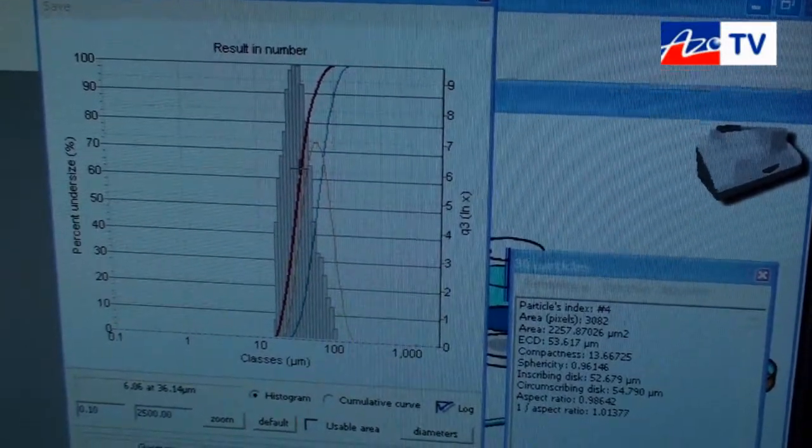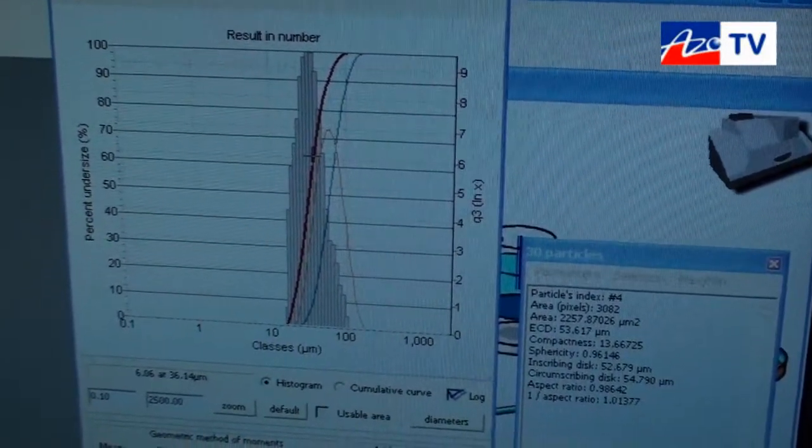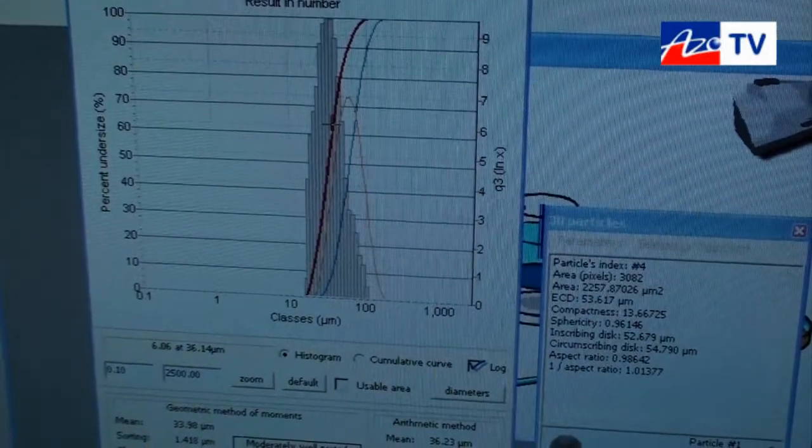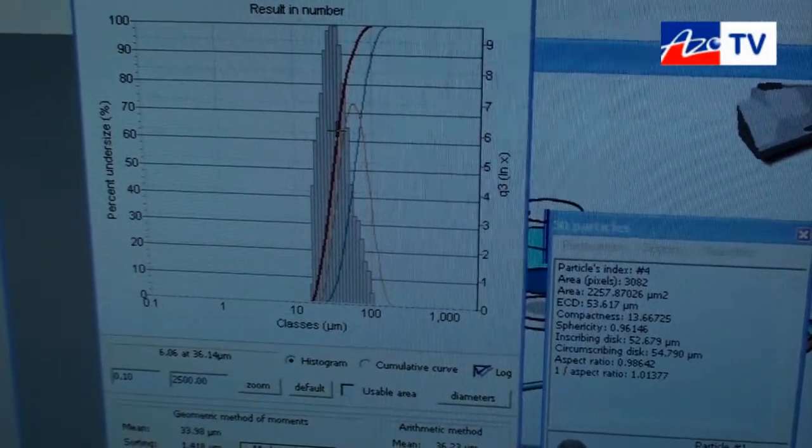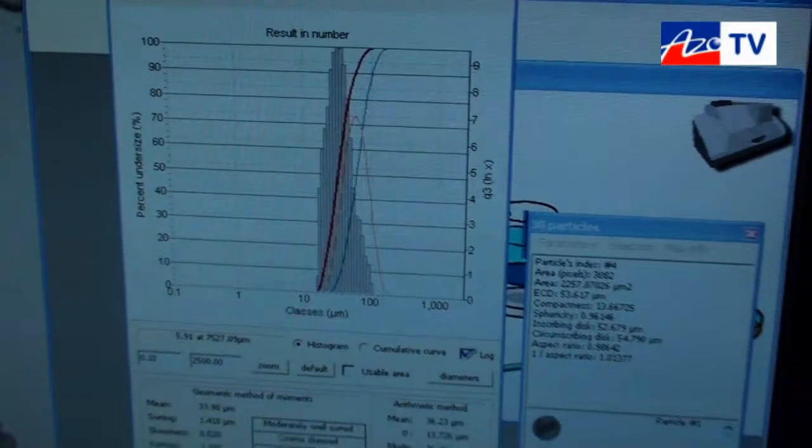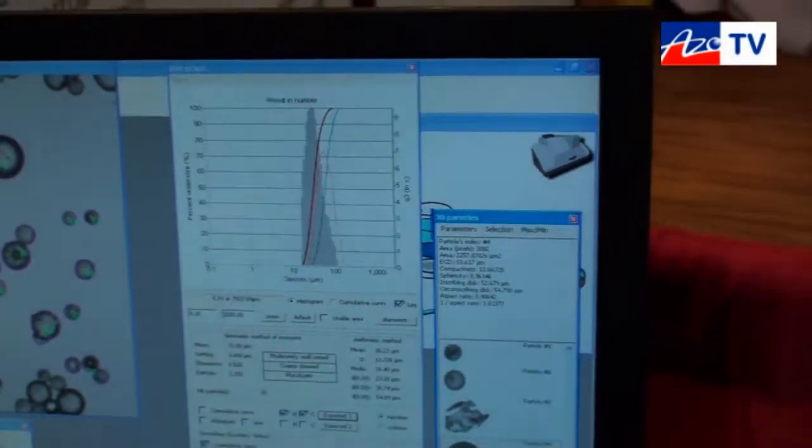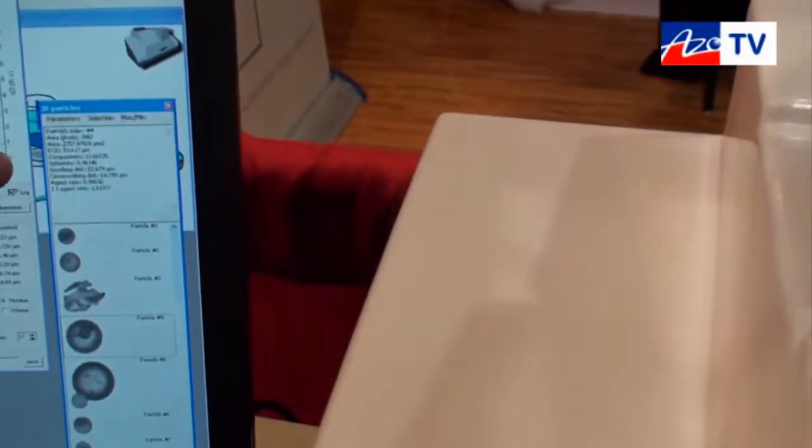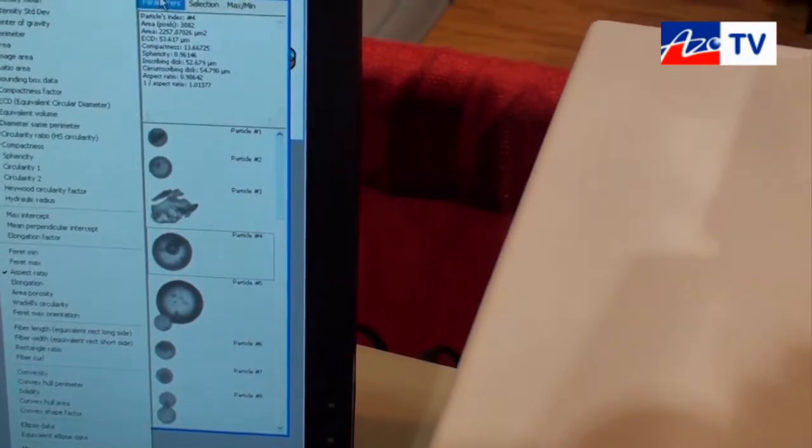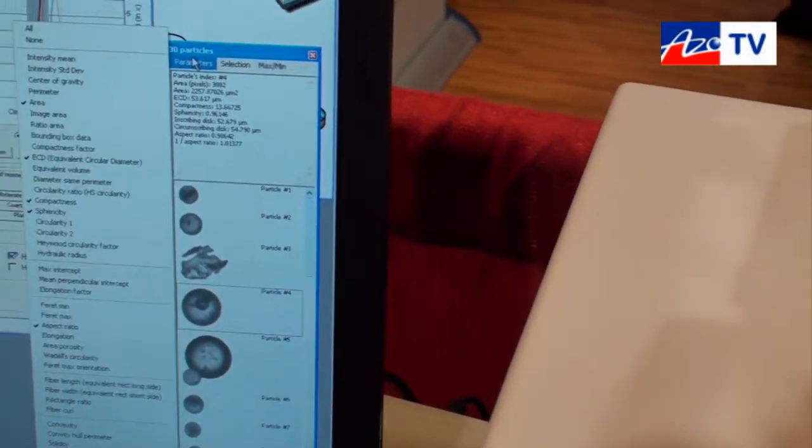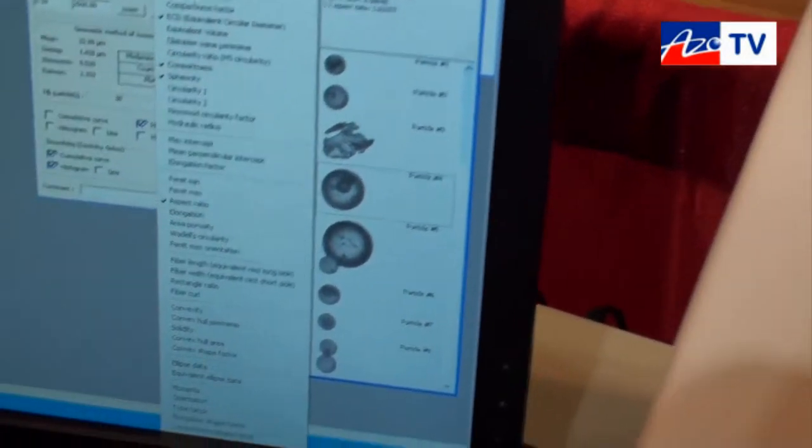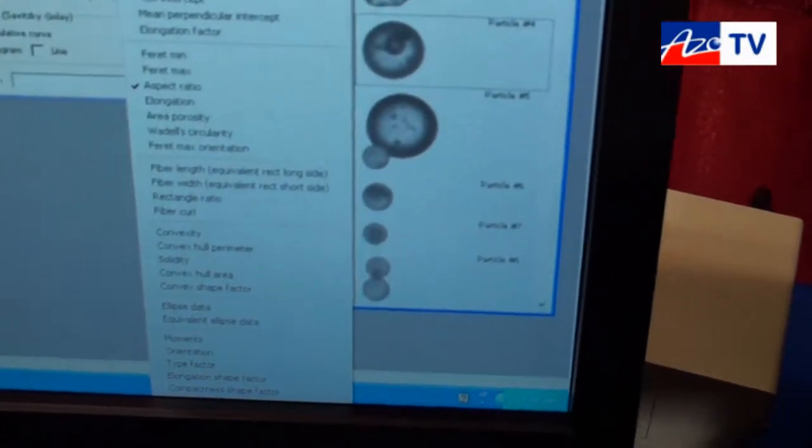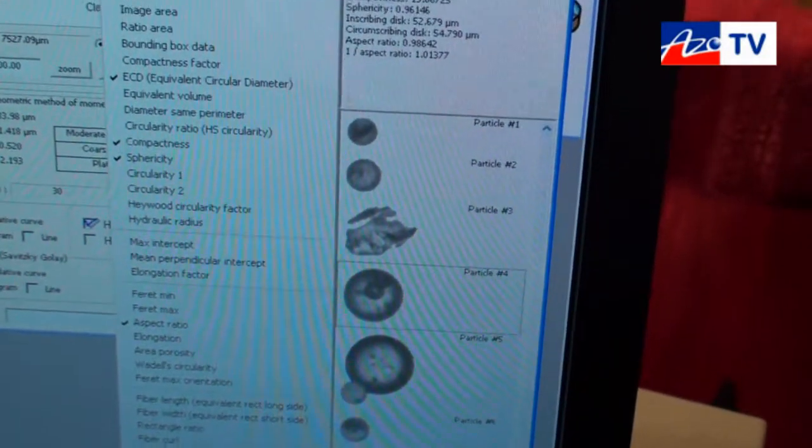We can also get information on one particle and look at a varying degree of parameters, so various size and shape factors, compactness, equivalent circular diameter of a non-circular particle.